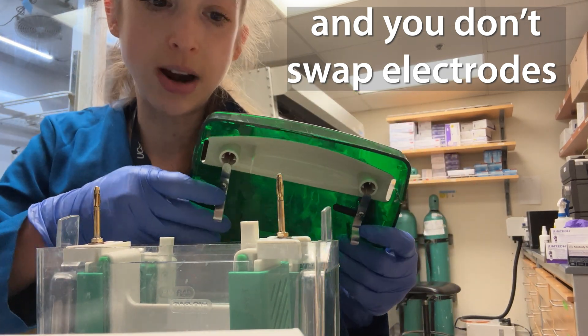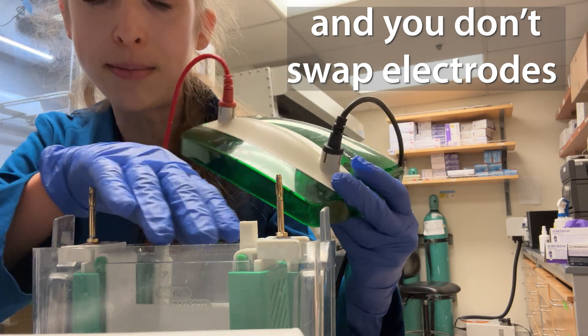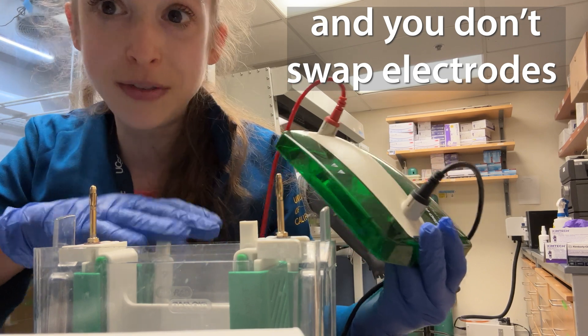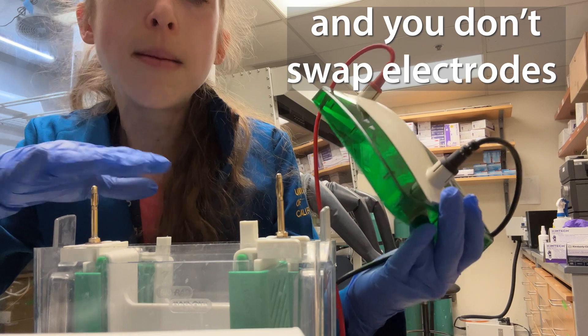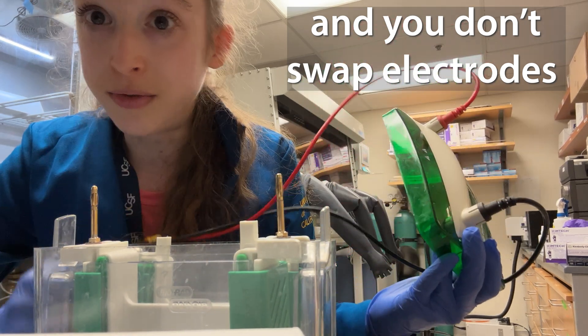Make sure your electrodes are always in the right direction. Thankfully they color-code this, which makes it really easy — red to red and black to black. If it feels like it's not going on right, you're probably doing something wrong, so make sure everything is set up correctly and your run should hopefully go okay.